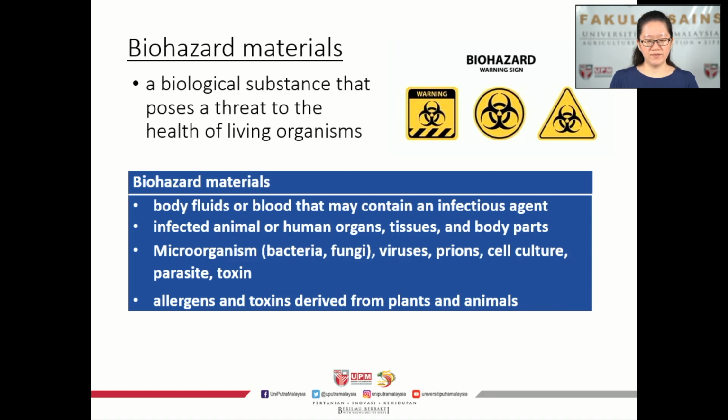So we have been talking about hazard and we have been talking about biosafety for a bit now. So what exactly is biohazard? Biohazard material refers to any biological substances that pose a threat to the health of living organisms.